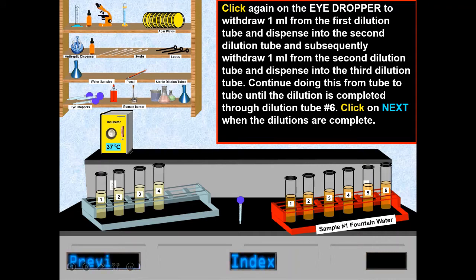Then the eye dropper was used again to withdraw 1 ml from the first dilution tube and dispense into the second dilution tube. Subsequently, 1 ml was withdrawn from the second dilution tube and dispensed into the third dilution tube.